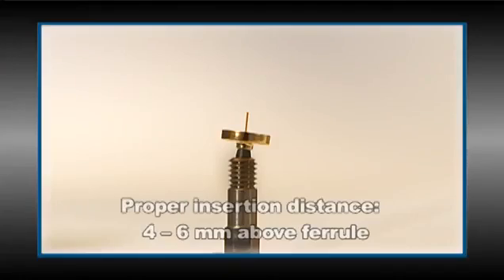these chromatographic issues, is that the column may not be installed properly. If we create a turbulent flow by doing a poor installation, this will generally show up as peak tailing. Getting a clean cut, getting the right distance of the column into the inlet and the detector, getting everything leak-free, all play a role in proper installation. If we have too much column up in the inlet, we create dead volume. If we have too little column up in the inlet, the column is down in the hole of the gold seal, and turbulent flow is in that area. So too low or too high is not good.